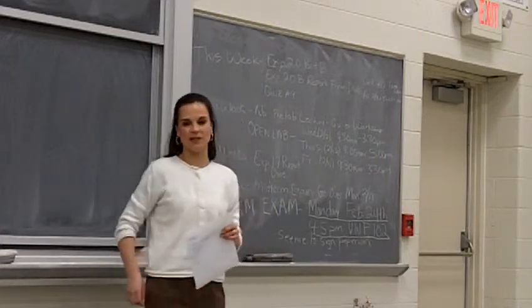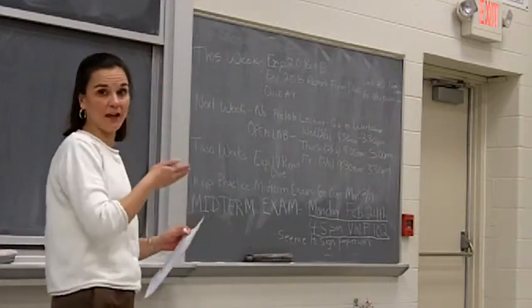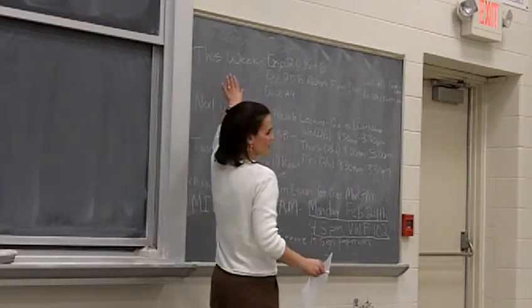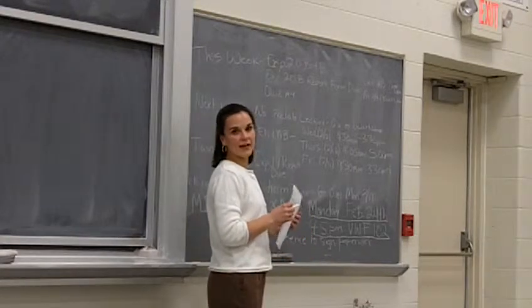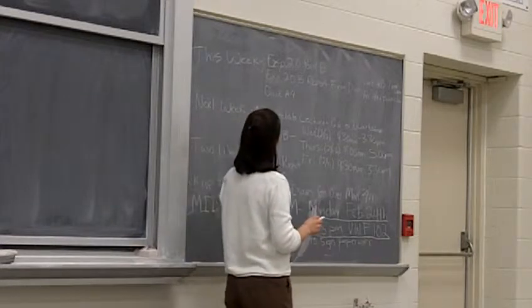In our effort to take care of the fact that we missed the first week of lab, we're not doing experiment 20 part A, if you recall. We're doing experiment 20 part B. So this week, you should have gotten from your lab prof at least what acid chloride you will be using this week, so you can prepare your pre-lab.